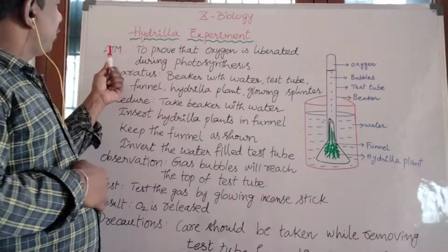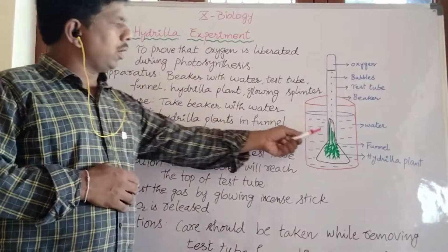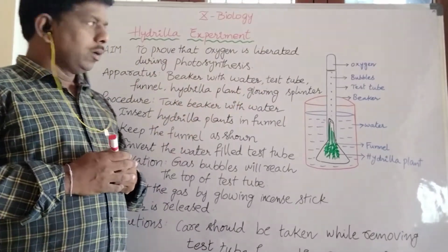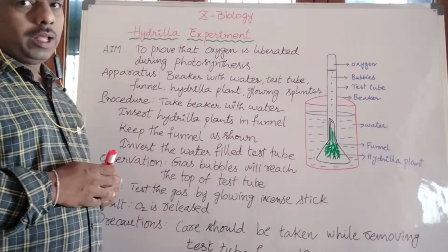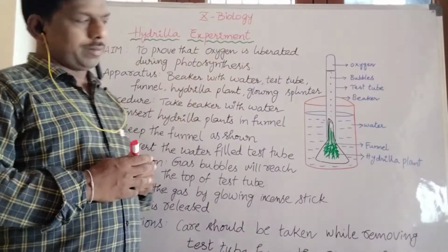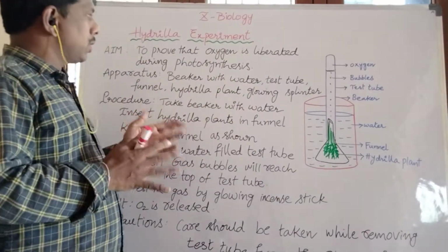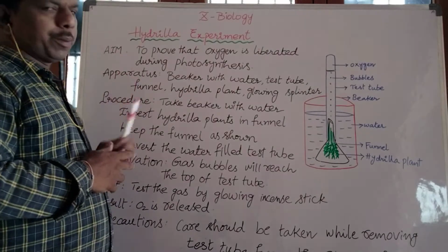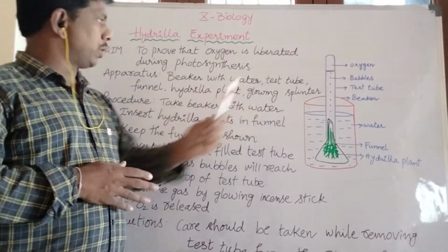First, the aim of this experiment is to prove that oxygen is liberated during photosynthesis. Actually, in photosynthesis, oxygen is liberated. So, how is that oxygen liberated? We have to test that in this experiment. So, the aim of this experiment is to prove that oxygen is liberated during photosynthesis.